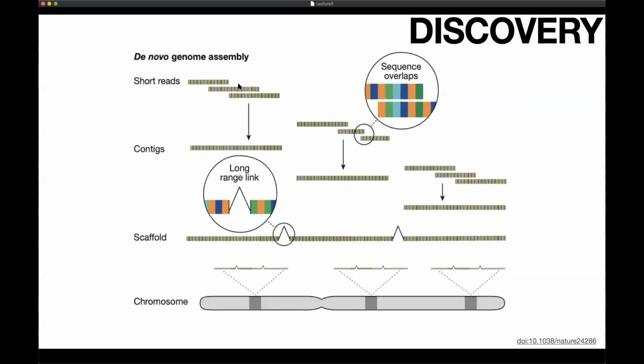The nice thing about this is that you don't actually need to know what the outcome is. You can use just sequence overlap and some other clever tricks to lay out the entire or most of the DNA molecule without having any idea what it was. I mean, when people started assembling the first sets of genomes, we didn't really know what to expect.